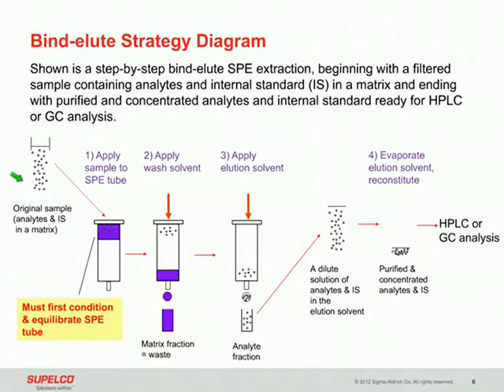The original sample is loaded into the preconditioned SPE tube or cartridge, and the analytes remain bound to the cartridge, whereas the matrix components and unwanted components are washed through using the wash solvent. Then the elution solvent is applied, and the analytes are eluted from the cartridge. Then they're pre-concentrated, and HPLC or GC analysis is done.